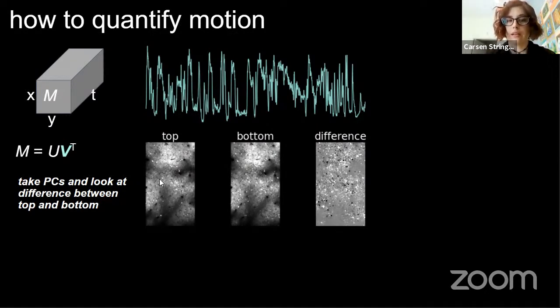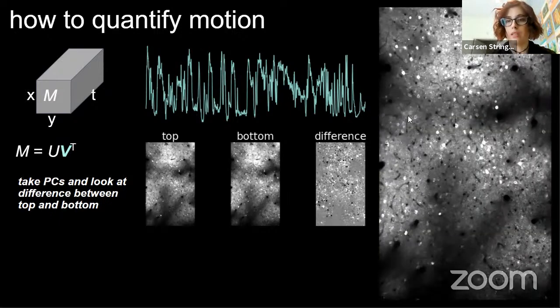It is hard to tell in static images. So in the GUI, when you open up this window, you also have the option to play them side by side. They flash back and forth, the top and the bottom. People who look at these things a lot can tell better, but if you look, you can see that in the flashing, it looks like cells are just turning off and on. It doesn't look like parts of the field of view are shifting. And actually, I'm sorry, I should have put an example in here where they're shifting.